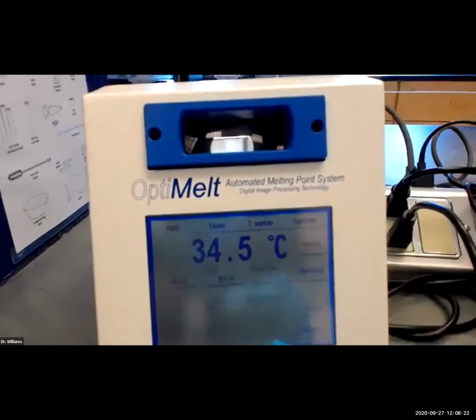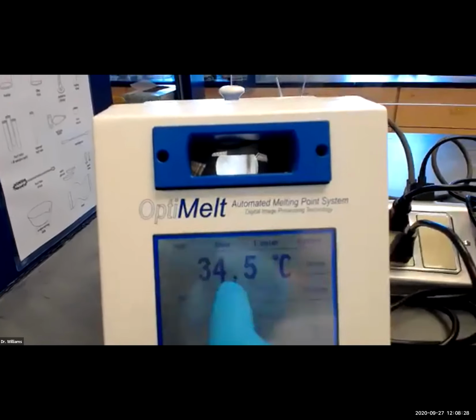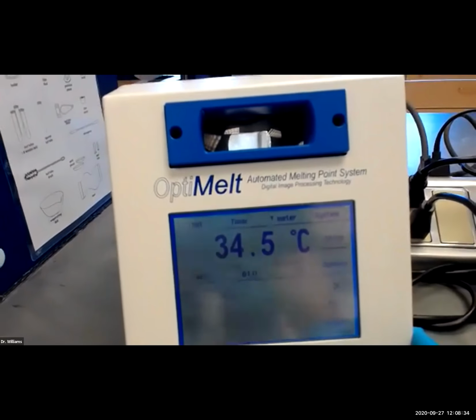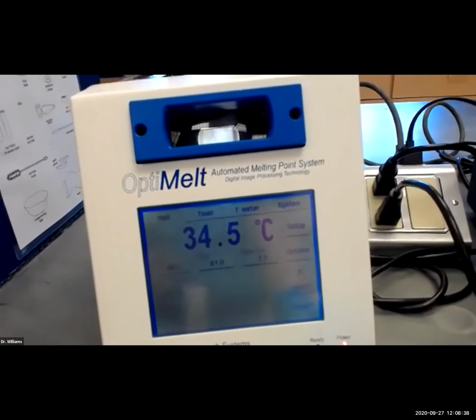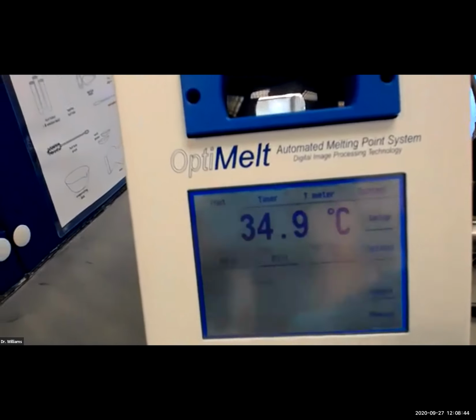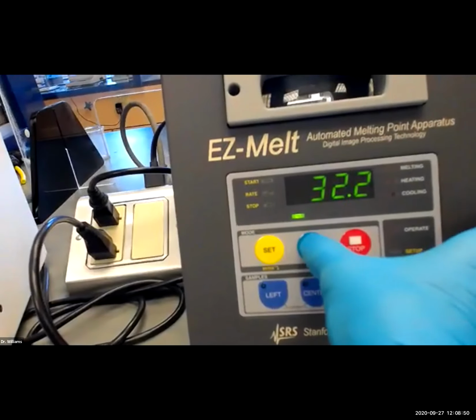That will bring it up to the temperature. The temperature which is shown there is the temperature of the device. It'll probably cool to room temperature if it sits there long enough. But I want to bring it up rapidly to my start temperature. So you press the heat, and it will beep when it's done. And you'll see the green button here, which will illuminate. And that means it's safe to put your sample in. You don't want to put the sample in until you reach the start temperature. The same thing with this one. So we're going to press the start button.